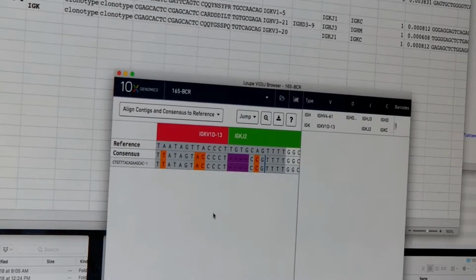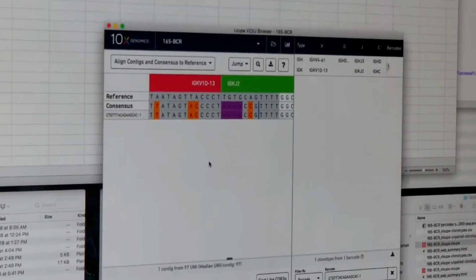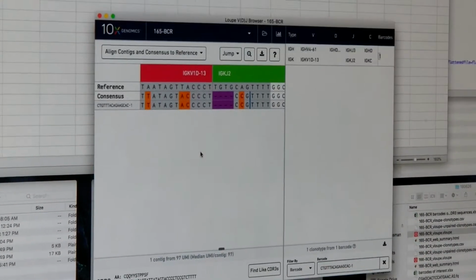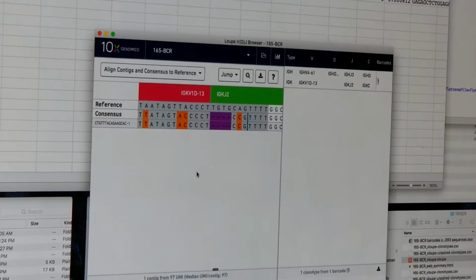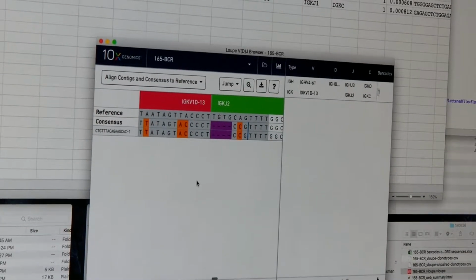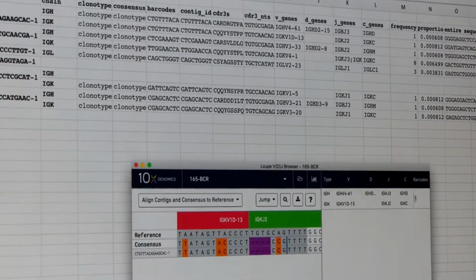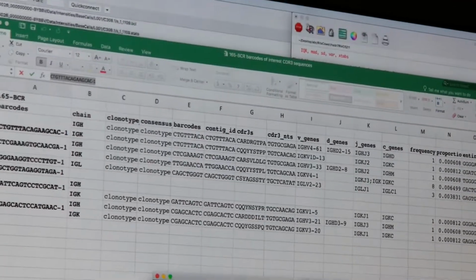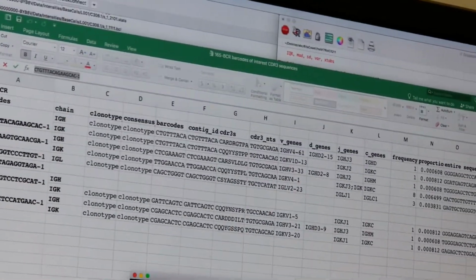Okay. Now, is there a way to convert that into a protein? I know there is a way to convert it into a protein, but then you say, well, this change here in the V region upstream, for example, changes the entire frame shift, and it's just not going to work. I don't know if there's a way to throw those out. There is. Let's see. This can't be a real protein kind of thing, based on something. So let me see here.